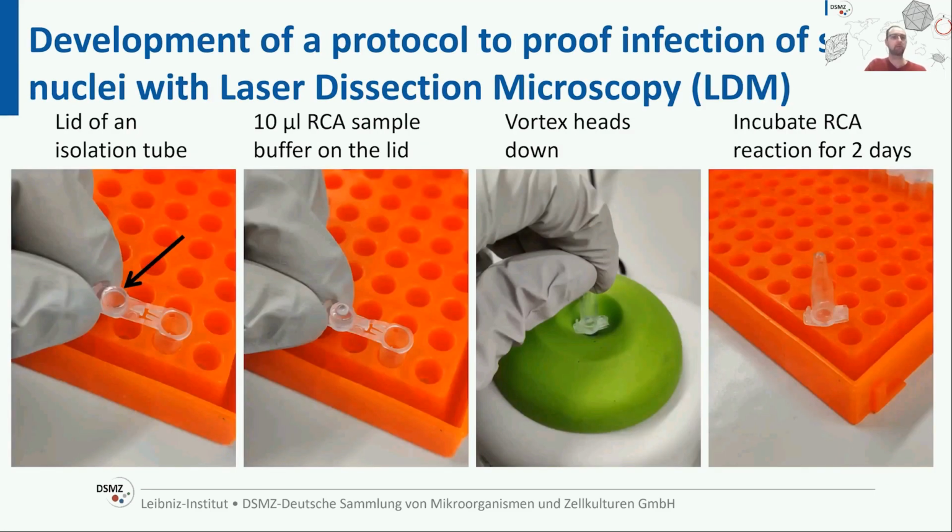So again, the RCA or qPCR analysis can be performed. I will show you in the next slide the RCA results.